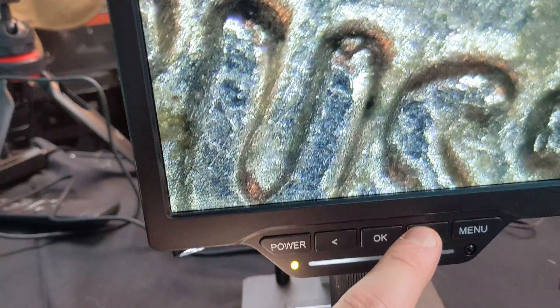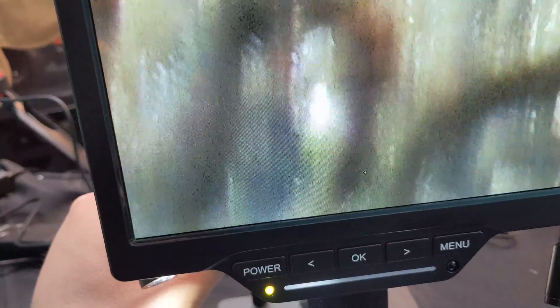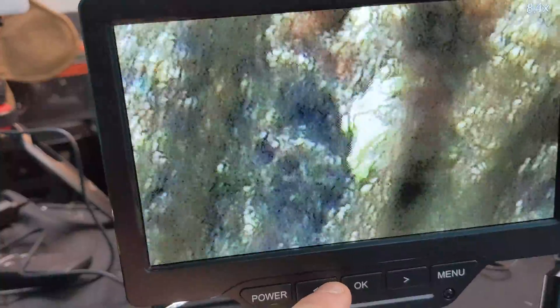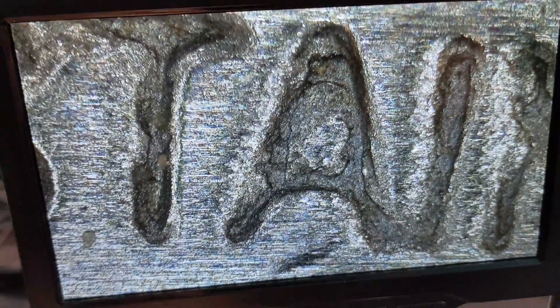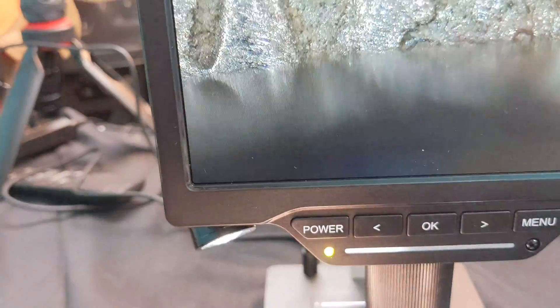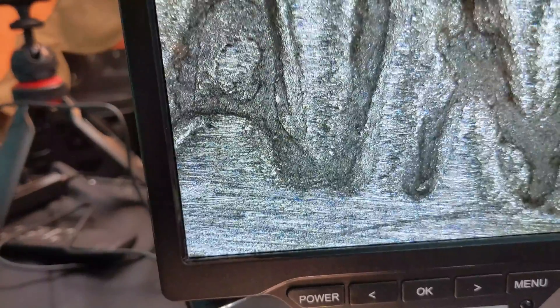Zoom right in — look at that. You can also adjust on the back while zoomed in to fine-tune the details. Now here's a knife — look how poor quality it was made. Look at the detail of the lettering: this stamp is supposed to say 'stainless.' From your eye it doesn't look too bad, but under the microscope you can really see how poorly it was made.